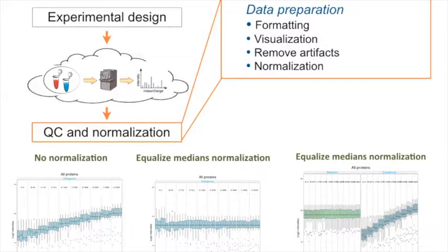If you have two groups and you anticipate there might be a global shift, global shift can mean different things. If we have 10,000 proteins, do you really think all 10,000 proteins change between two conditions? No, but a subset might, because of biology. Right, so if you think this subset is half, then you really need a standard. If you think this subset is 10%, then you can use median normalization. Okay, that's what I mean.